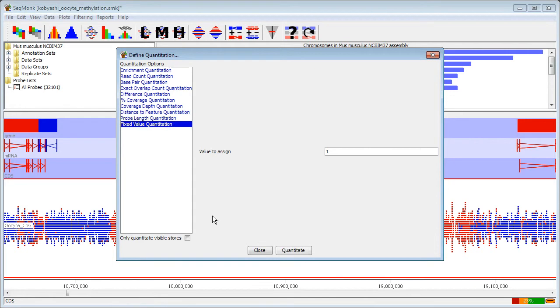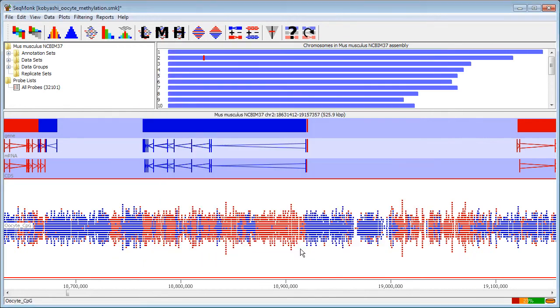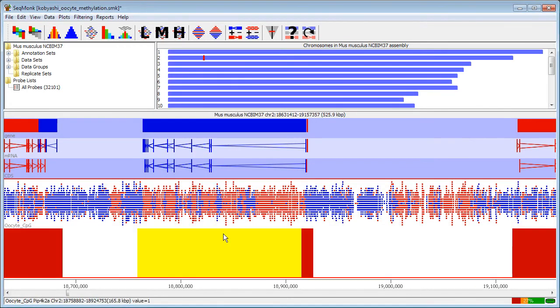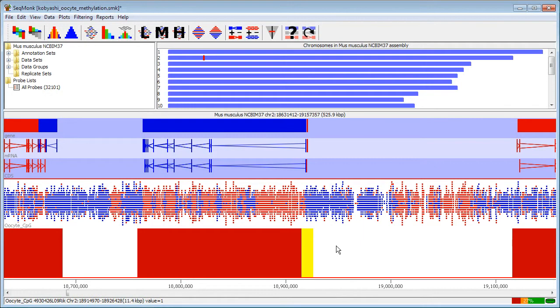I'll just do a fixed value quantitation on this just so they show up. And when I've done that, now what I'm going to do is to fragment these regions into shorter overlapping probes that I'm actually going to use to quantitate.